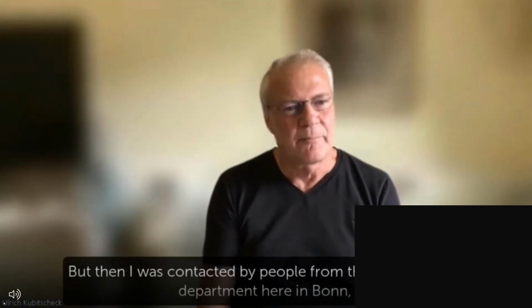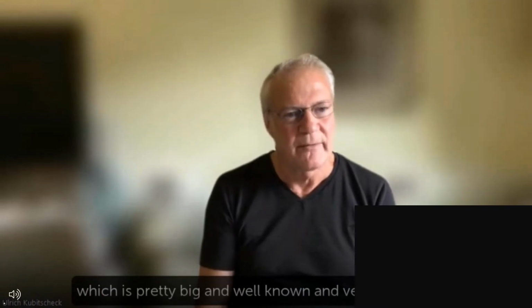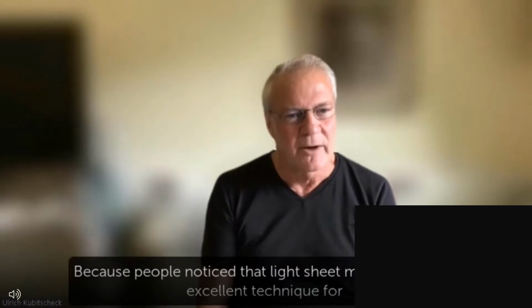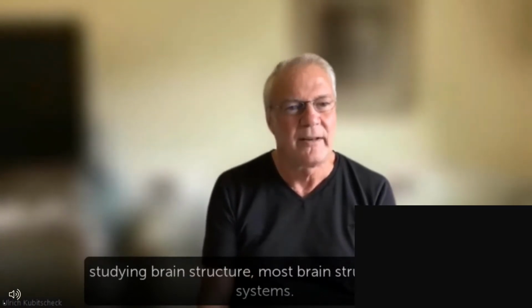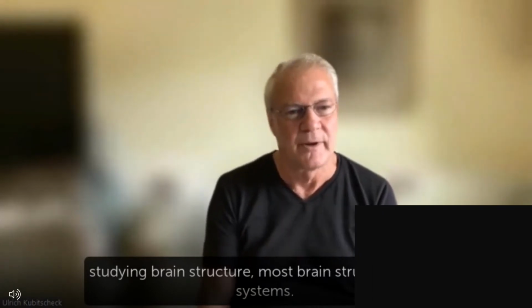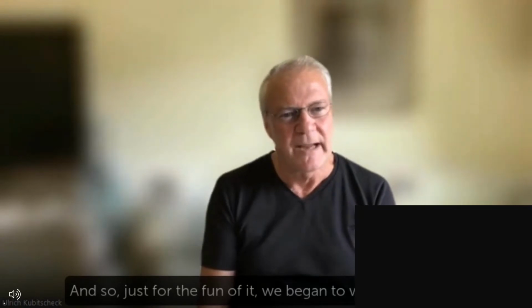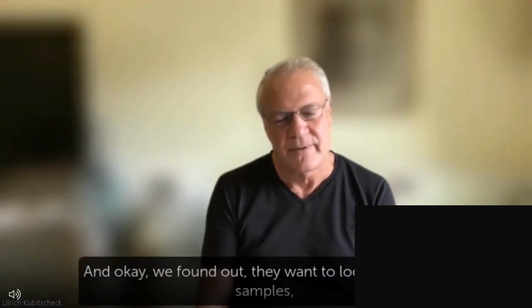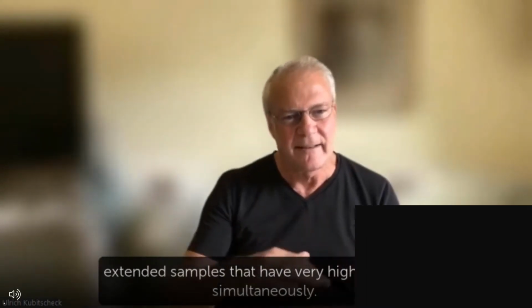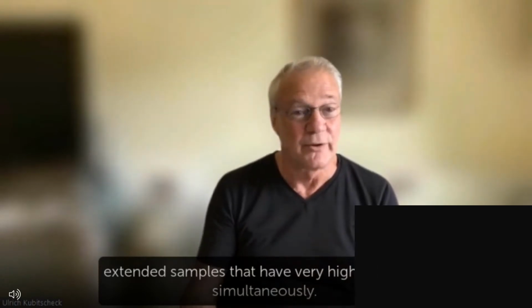But then I was contacted by people from the neuroscience department here in Bonn, which is pretty big and well-known and very productive, because people noted that light sheet microscopy is an excellent technique for studying brain structure in model systems. And so, just for the fun of it, we began to work with them, and we found out they want to look at really big, extended samples with a very high resolution simultaneously.